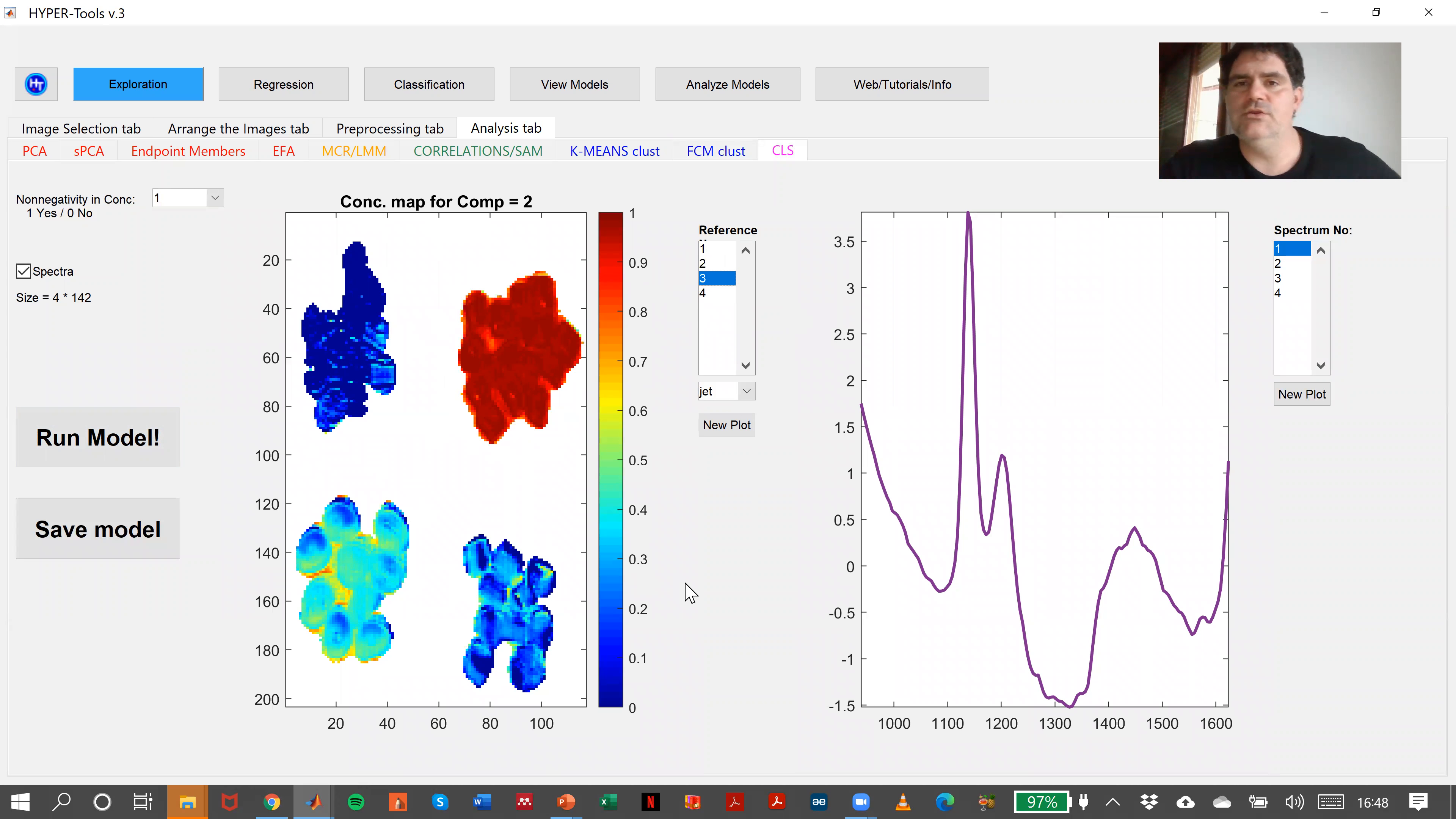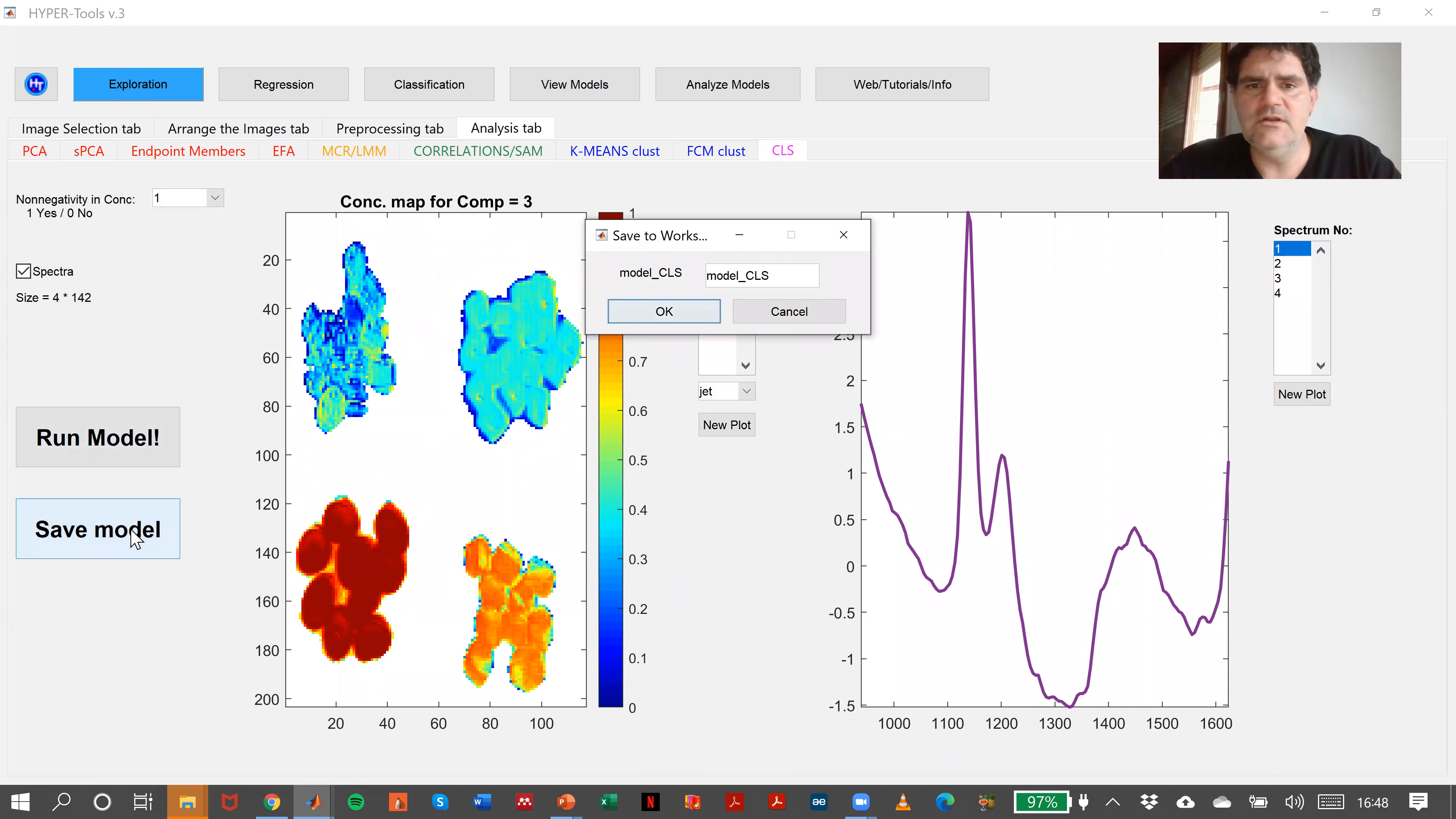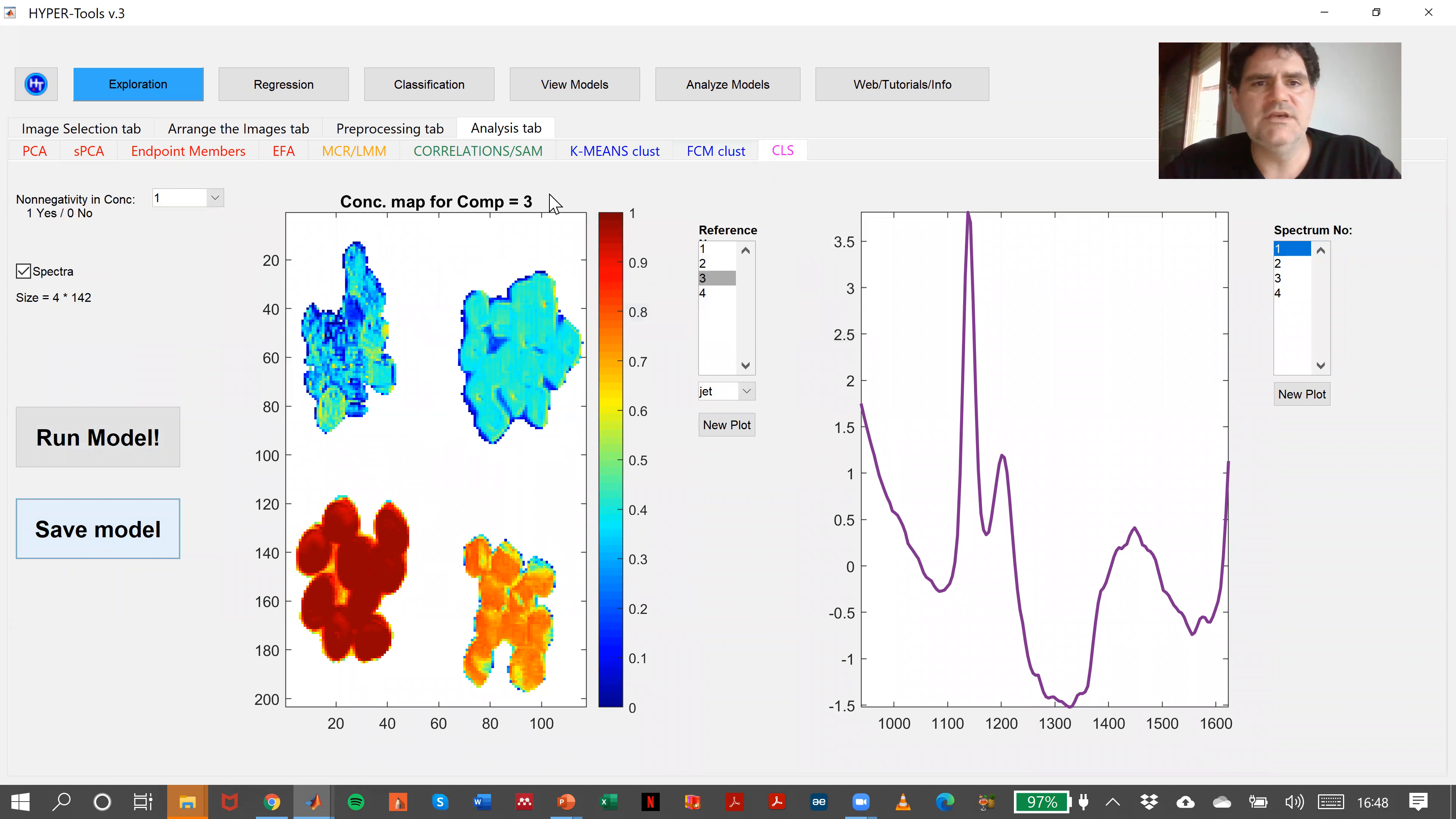Here we are, plastic two, plastic three will be here, and plastic four will be the other one. Okay, so now we save the model.